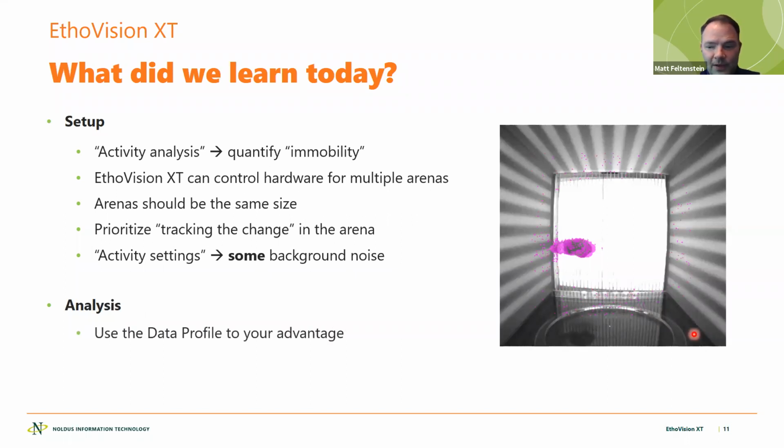Analysis, use the data profile to your advantage. I see a lot of people, not just in fear conditioning, who don't use the data profile to its full advantage. And when I show people how you can use it, 10 times out of 10, they're impressed, like, oh, wow, I didn't know you could do that.